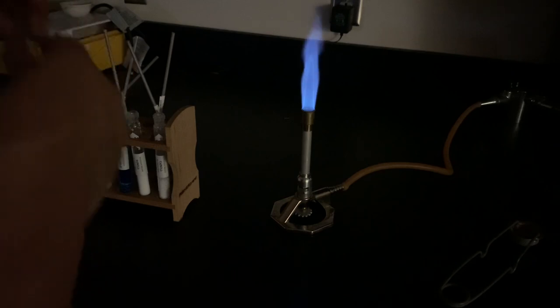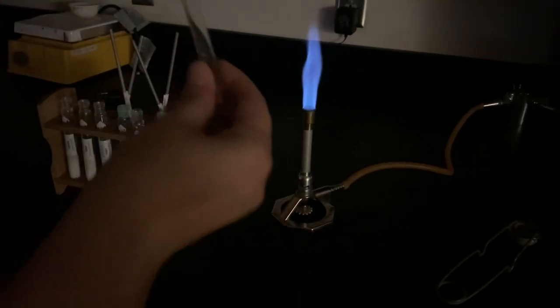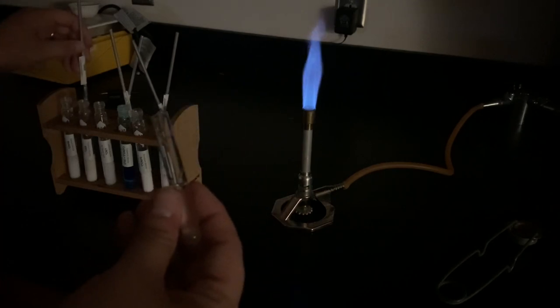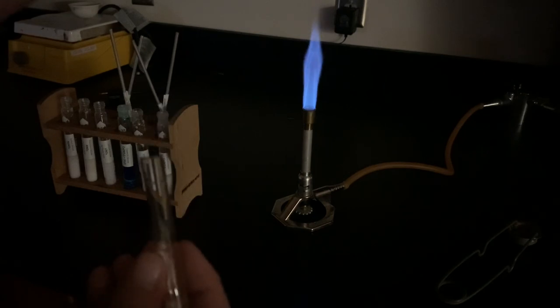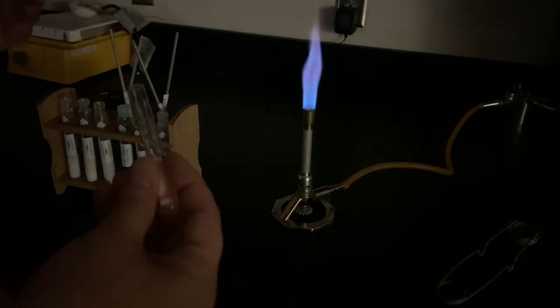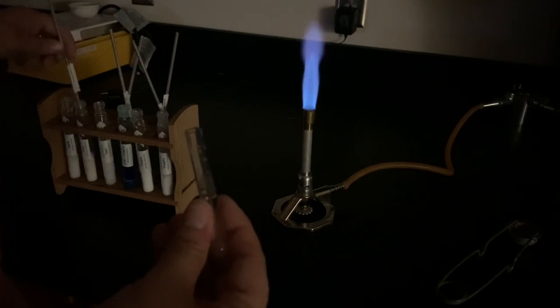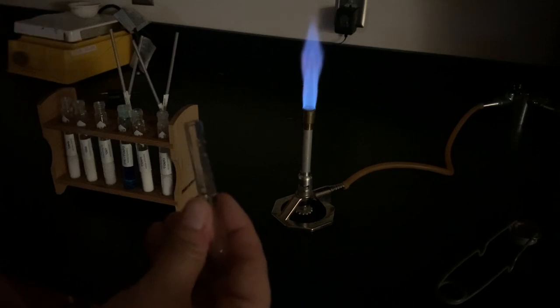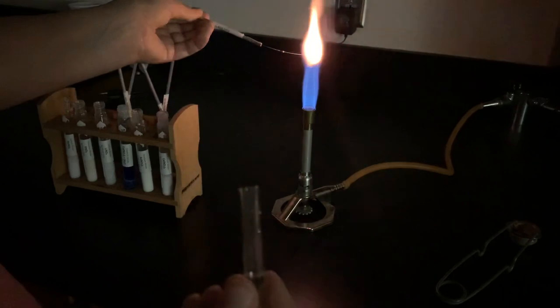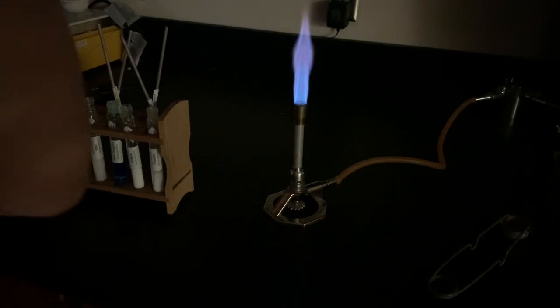It's really important to use a clean inoculating loop and clean water for each new test so I don't contaminate my different salts. This next one is potassium nitrate — I dip the clean loop in clean water, then into the potassium nitrate salt. You still see a little of the orange, but the color here is a light purple, called lavender. The orange is just from the metal of the inoculating loop — that light purple in the background is the potassium.